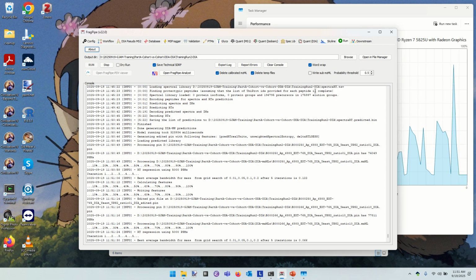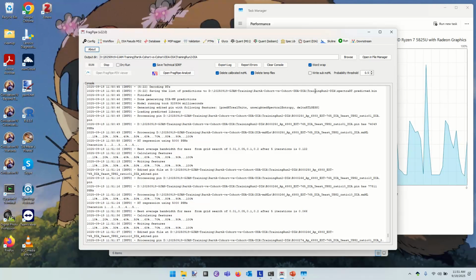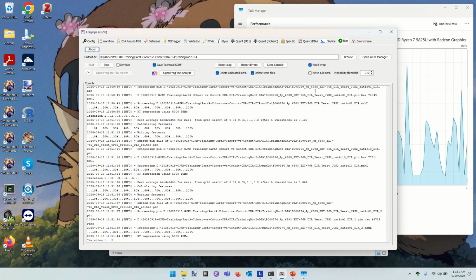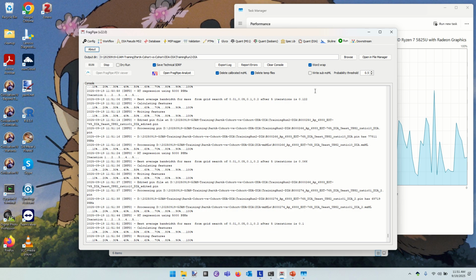Yes, retention time regression, and so on. In this case, we have the experimental problem that liquid chromatography, as used in proteomics, is a pretty approximate separation. Is it possible that the column goes gloop at some point and you end up with a bubble? Yes, that can happen, and it makes it harder to compare the intensities we see from this experiment to the ones we see in this one.